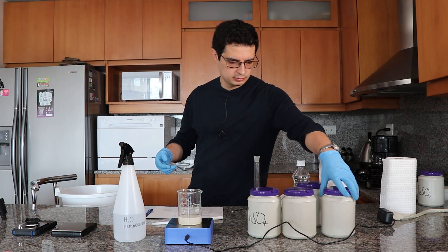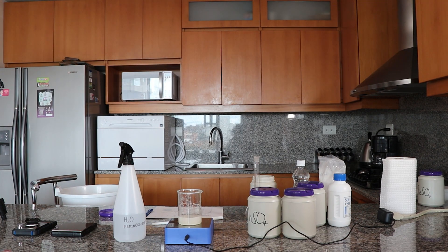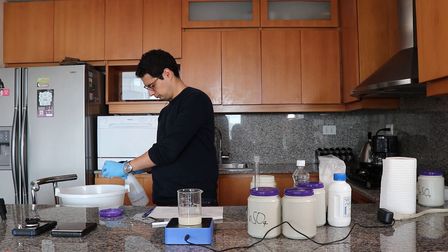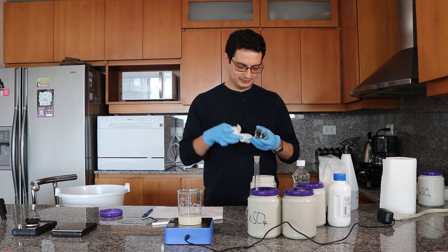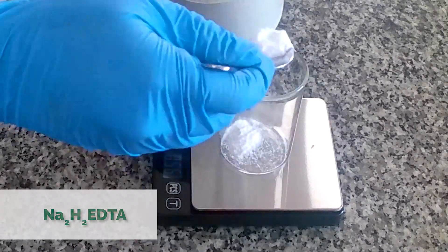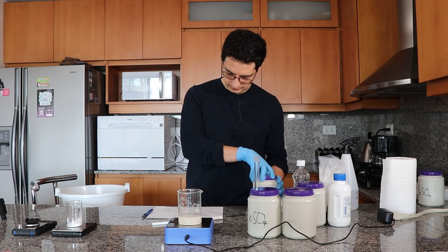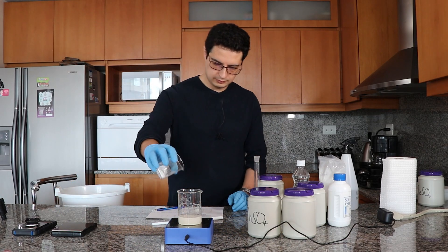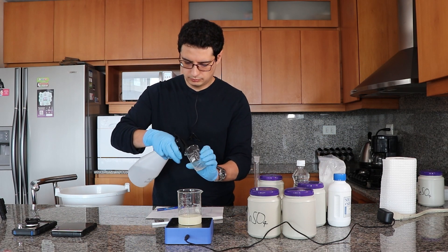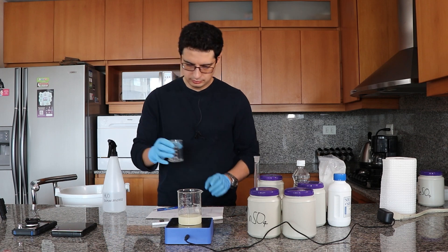Next I'm going to add the chelating agent disodium EDTA, which should help the ferrous sulfate dissolve. I'm using a small beaker for this addition because it's substantially more volume — 7.2 grams, but it's a lower density substance so it takes up more space. I'm weighing the 7.2 grams and transferring it to the beaker, using some distilled water to ensure I get all the mass into the final solution.